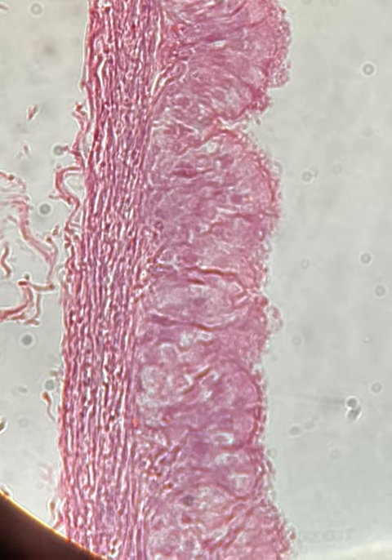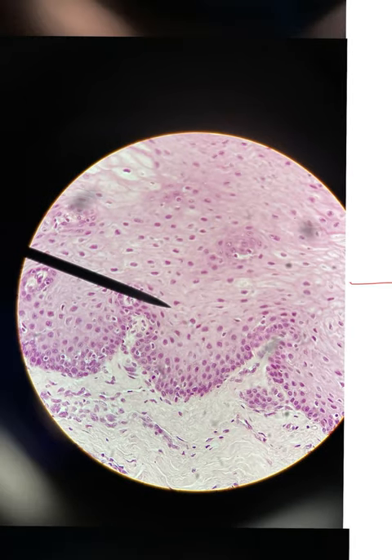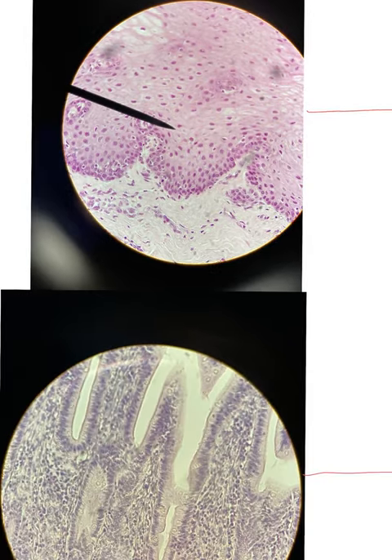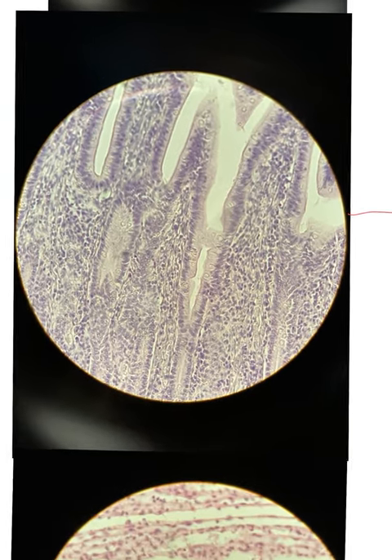Okay, now let's move on. Here again, we have another stratified, meaning more than one layer of, these are squamous cells, and these are going to be really important for protecting against abrasions. And these stratified squamous cells are found in your skin because your skin is really going to need protection from abrasions. So stratified squamous, protect from abrasions and found in skin.